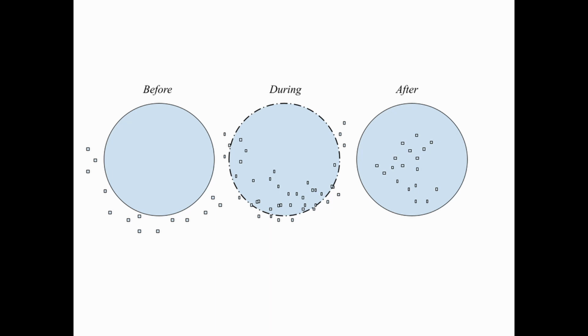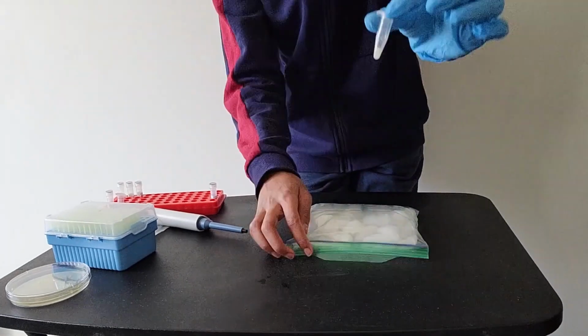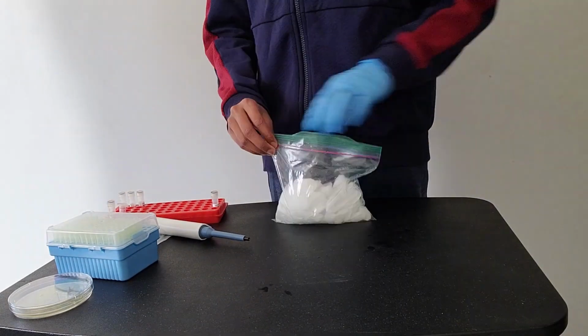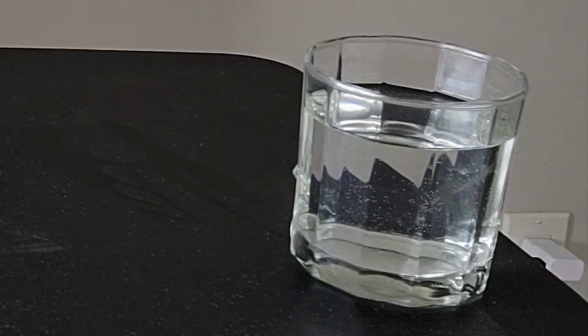Take the competent cell mixture microcentrifuge tube and put it in the fridge for 30 minutes. Instead of that, I put it in ice and it worked out well. Then take it out of the cold environment and incubate it in very warm water for 30 seconds. By doing this, we are changing the environment temperature drastically.